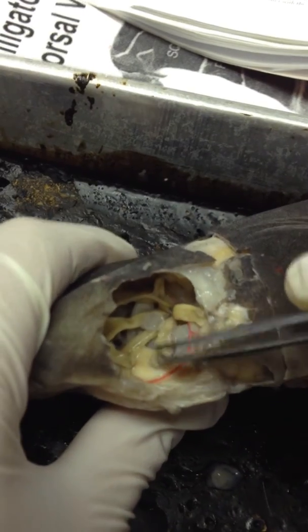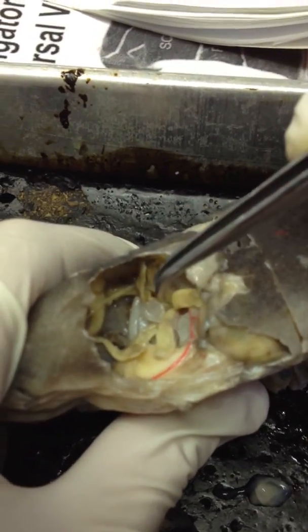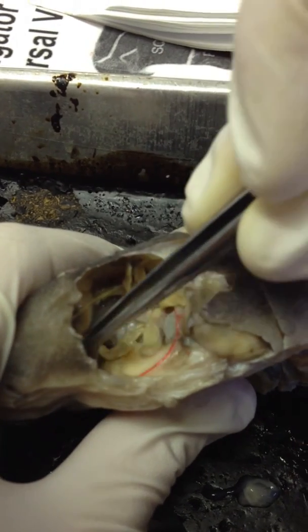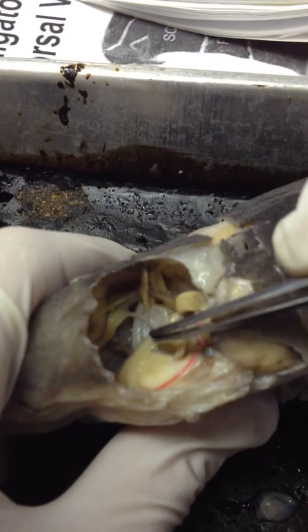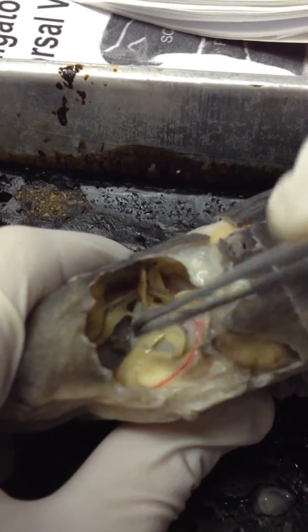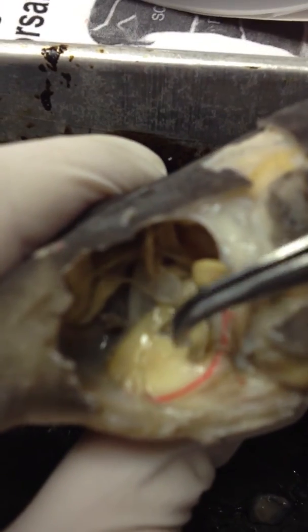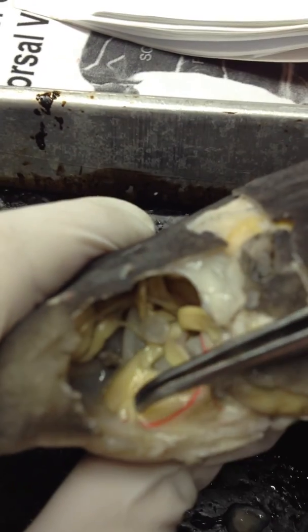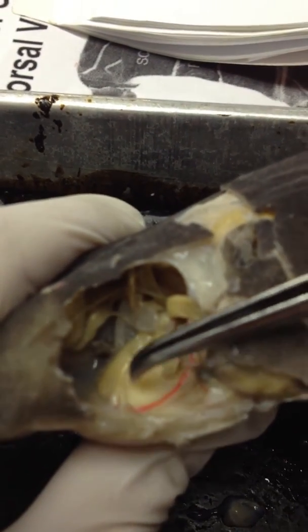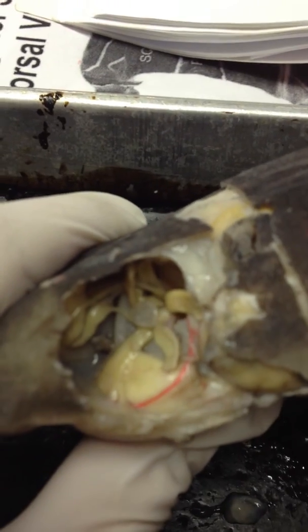Underneath the optic pedestal, we have the infraorbital nerve that comes down from here and splits into two nerves. You can't really see the split terribly well, but down below is the buccal nerve, and when it splits up, it goes into the maxillary nerve.